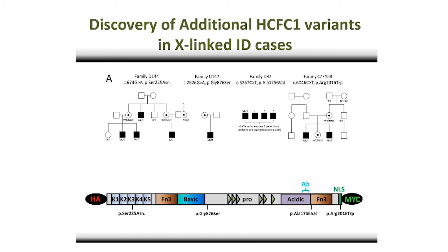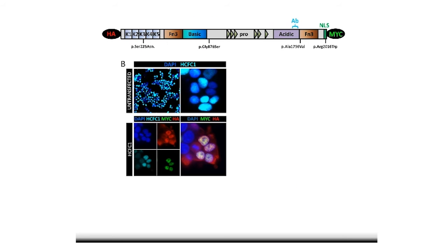One of the first things we did was to clone these variants into an expression vector and just see where they localized, with particular interest in the nuclear localization variant. So here, the schematic at the top shows that the expression construct we used had an HA tag and a MYC tag at both ends of the protein, and as I mentioned before, this protein is cleaved and can act as a dimer. We also have an antibody raised to the endogenous region, just here in the C-terminal spot. And so here is just what endogenous HCFC1 looks like by immunofluorescence.